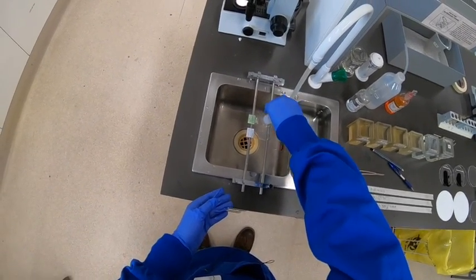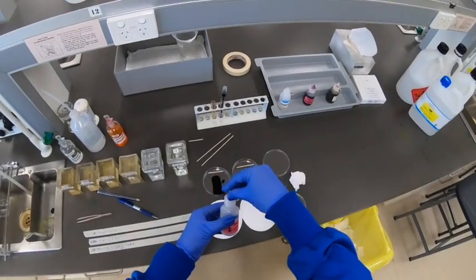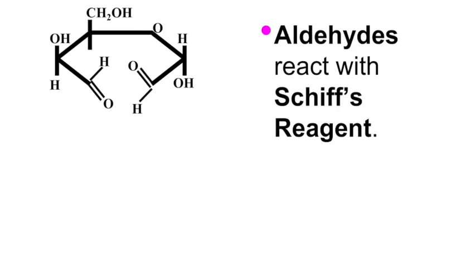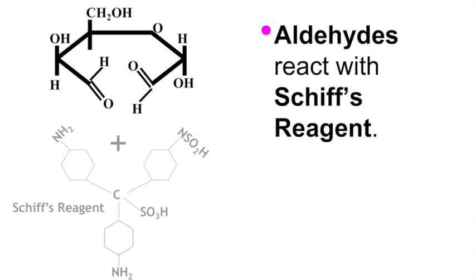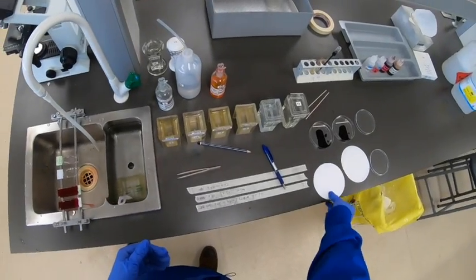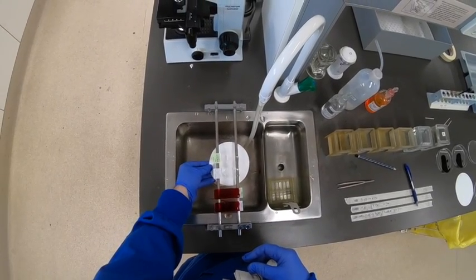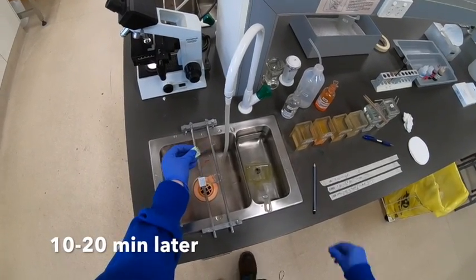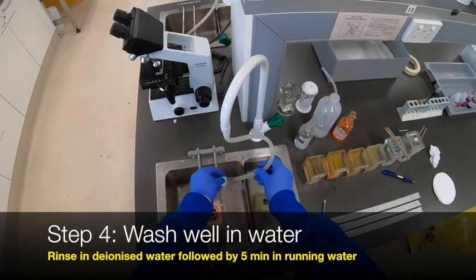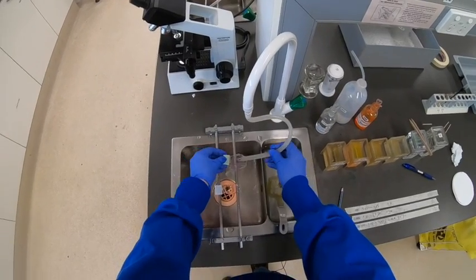Notice that both of these first solutions are essentially colorless. In the case of the Schiff's reagent, it doesn't really have any color until it binds with the dialdehyde groups. Then with the presence of water on the slide, there's a sulfonic acid group that's very unstable after binding, and you can start to see a little bit of color change over time. After 15 minutes you can actually see a bit more of a color change at this point, but it's still not really fully complete.